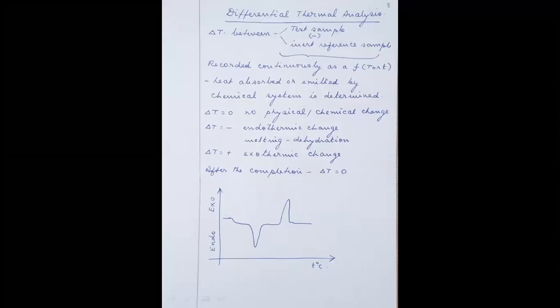So now listen, differential thermal analysis means we are going to measure the temperature difference between the test sample and an inert reference sample.